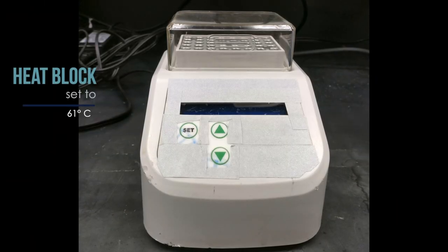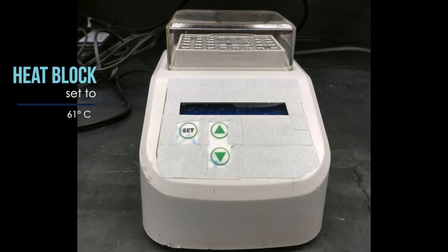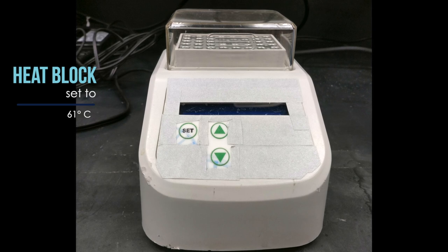The first thing we do is set the heat block to 61 degrees Celsius. Switch on the power in the back and hit the set button.